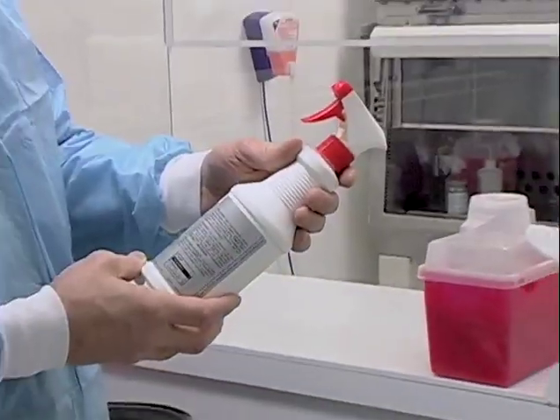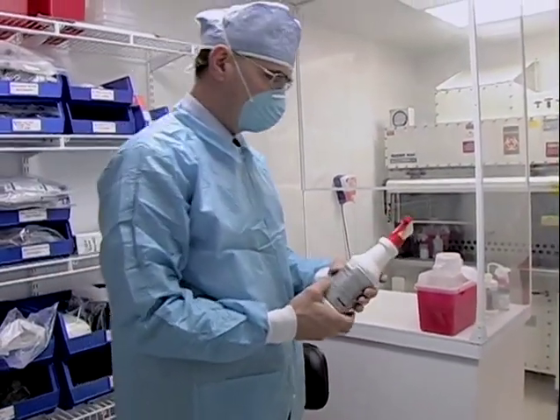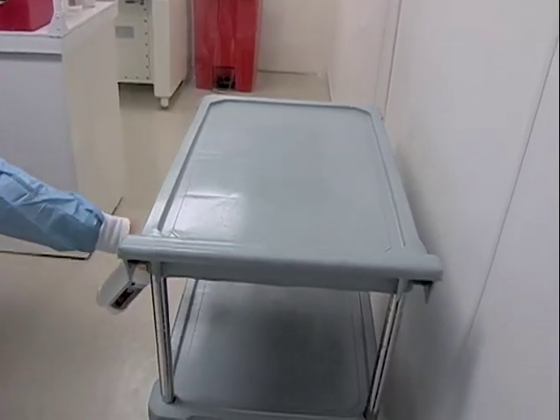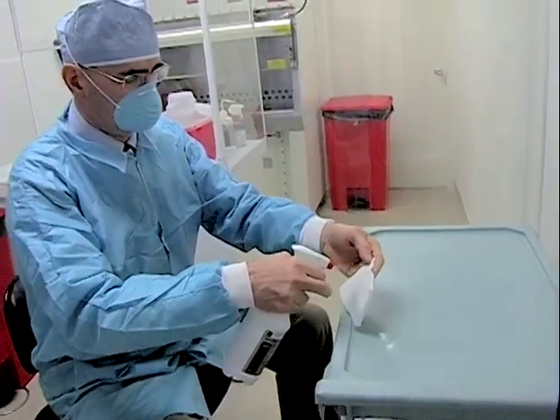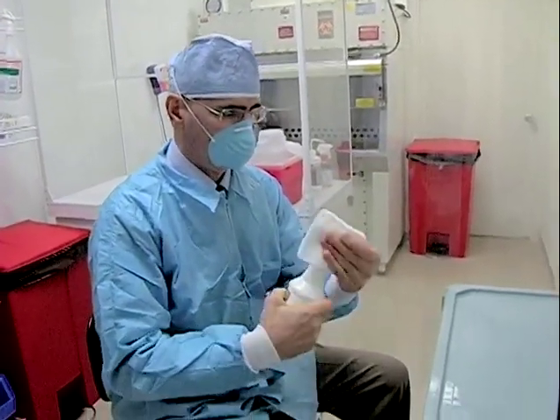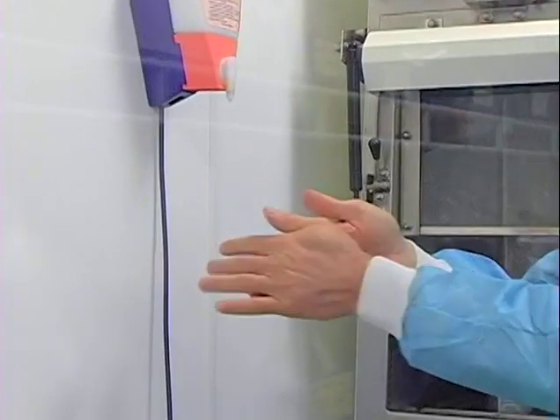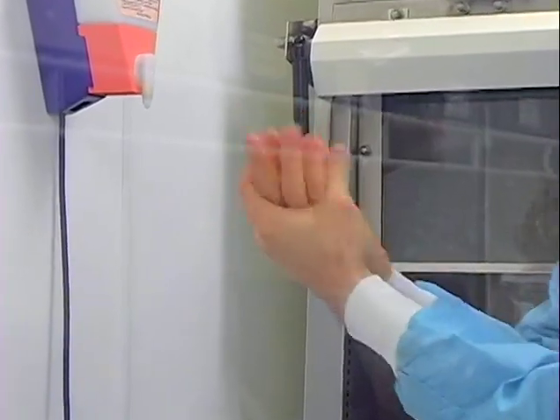Another updated USP 797 requirement is the use of sterile alcohol as a periodic disinfectant for gloves and critical work surfaces. Because alcohol alone is not a sterilant and may itself become contaminated, the use of sterile alcohol assures a sterile disinfectant baseline condition, thus preventing the introduction of residual spore-forming or other resistant microorganisms to critical surfaces during its application. Upon entering the buffer area, the hands are to be carefully resanitized with a waterless, alcohol-based surgical hand scrub, such as chlorhexidine, prior to aseptically donning sterile gloves.